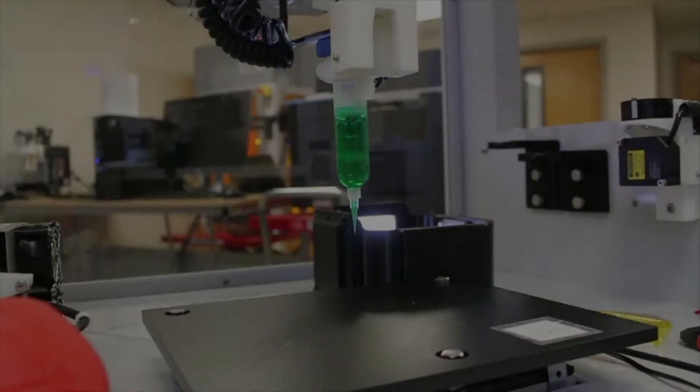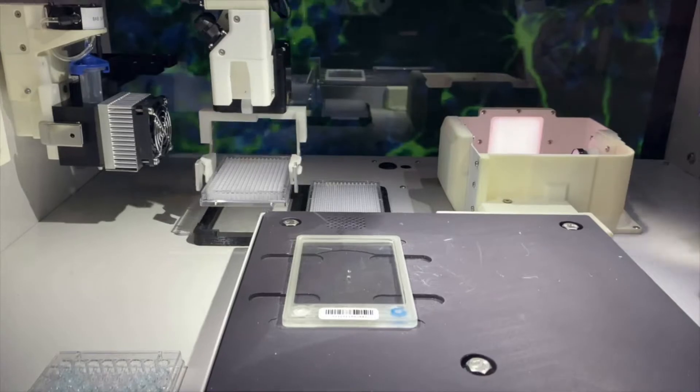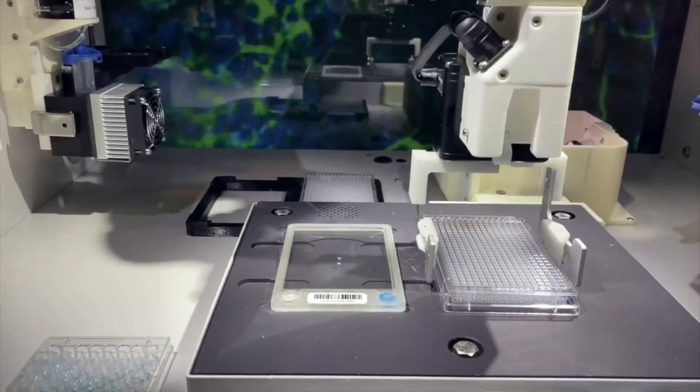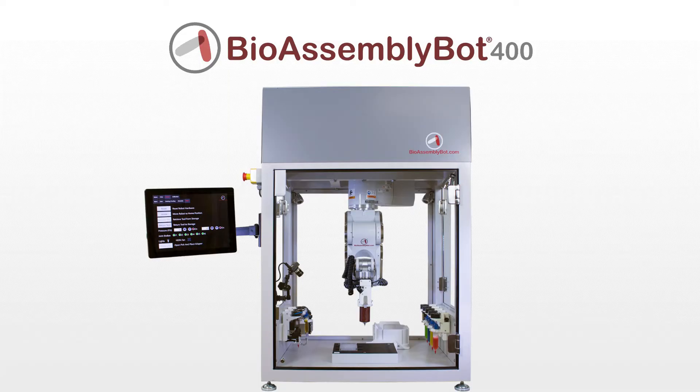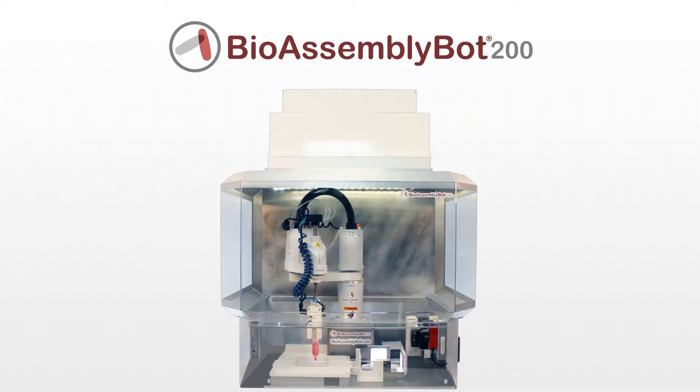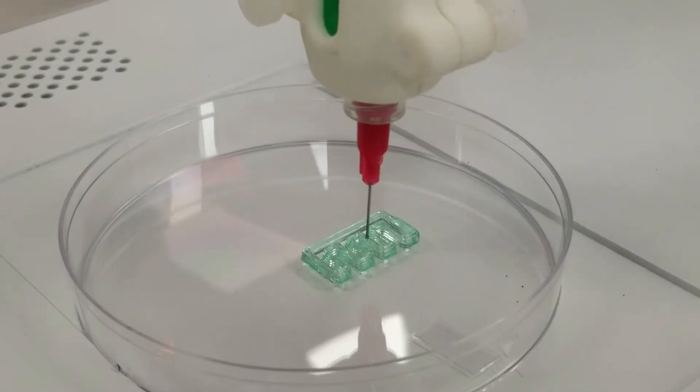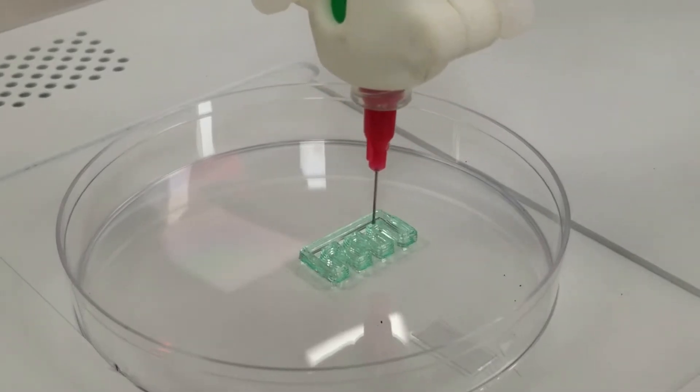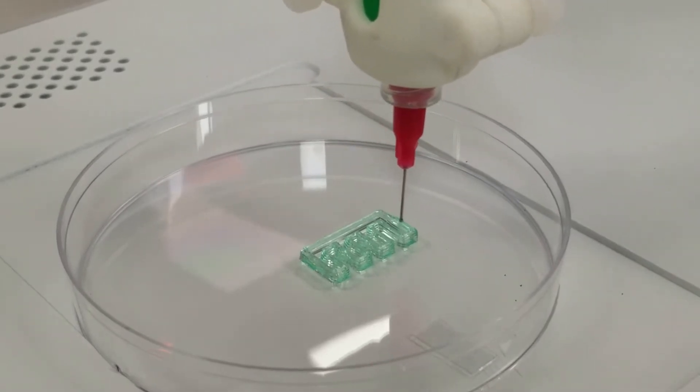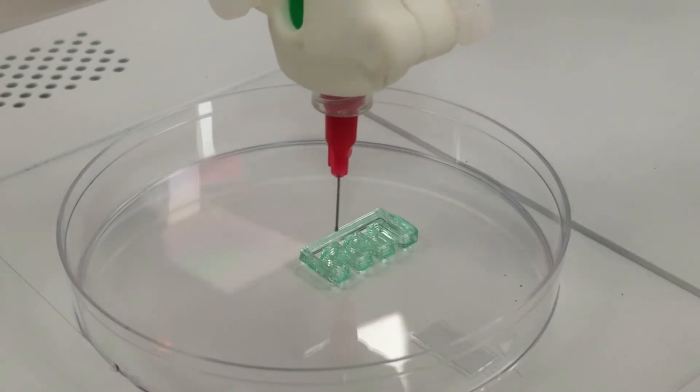BAB is a versatile and flexible system available in different sizes and configurations, but sharing a common bond of enabling a teachable robot platform to automate 3D biology and build 3D human tissue models.